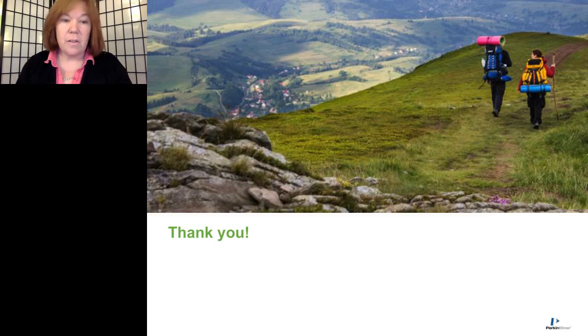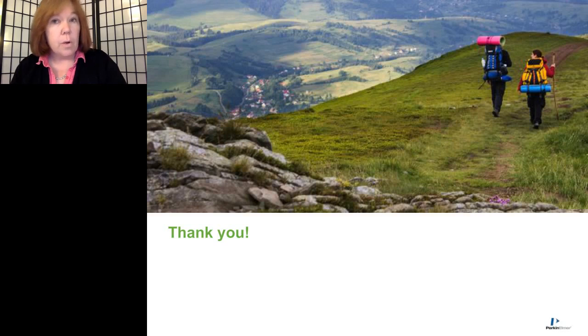Thank you, Dr. Lopez. Excellent presentation, lots of good information. Before we get to questions from our audience members, I just want to remind them how to reach us today. Questions can be submitted by the green Q&A button at the lower left of your screen. And we do have one right now in our queue. An attendee asks, does the type of heparin tubes for blood storage prior to plasma isolation impact the yield of cell-free DNA?